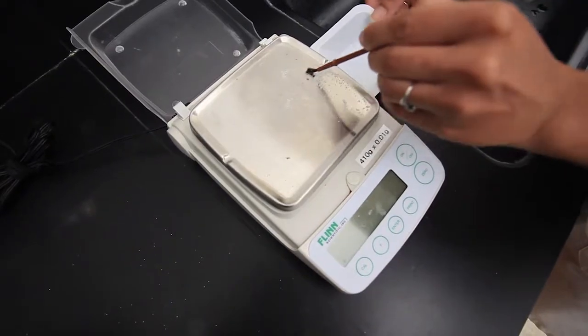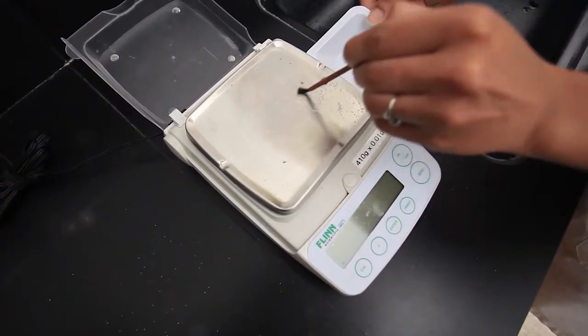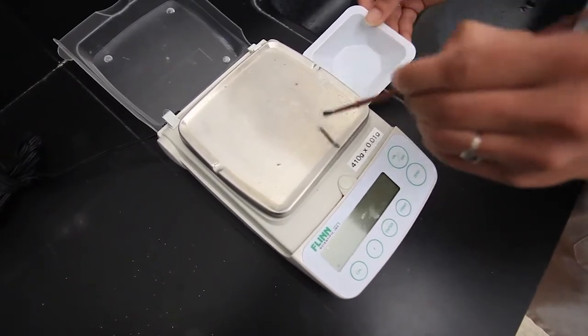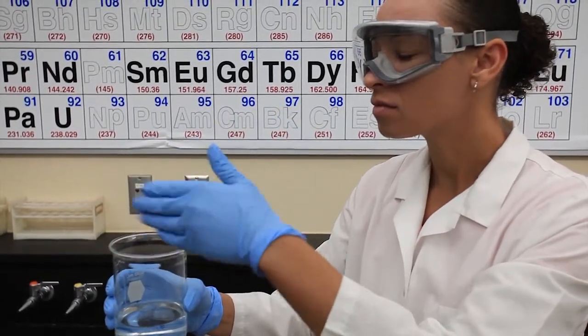Refrain from placing too heavy or hot objects directly on a balance. When finished using a balance, make sure to clean up any mess you have made. This makes for a happy camper when the next person needs to use it. Never smell chemicals directly. Use a wafting technique, or better yet, ask your instructor to help you identify a chemical if needed. Directly smelling a chemical can cause severe to irreversible damage to your sinuses and lungs.